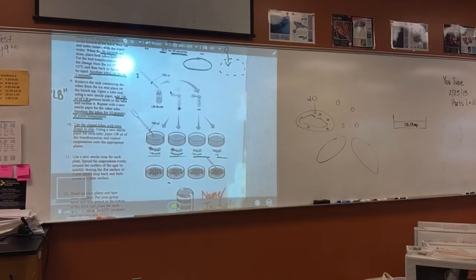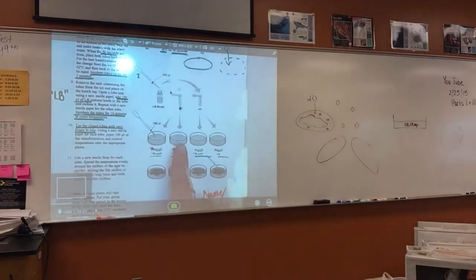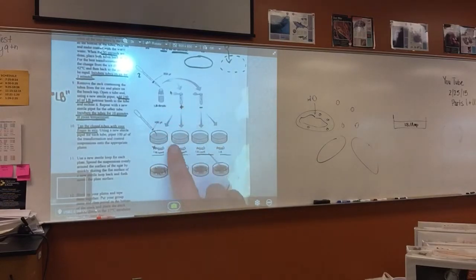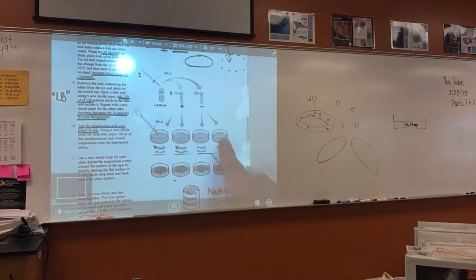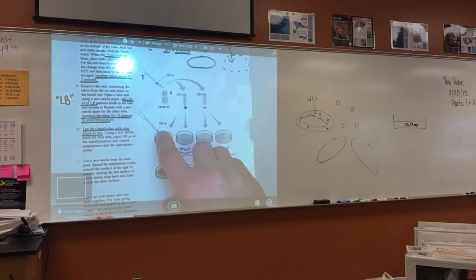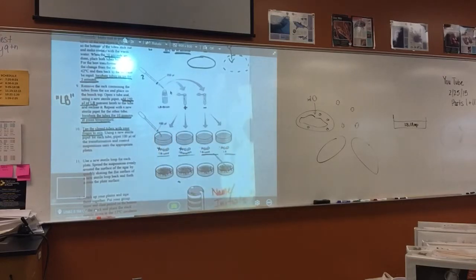When you're ready to plate it, you take your four plates. Tap the tube on your table to get all the liquid to the bottom, because when you flick it, it may splash a little bit along the side. And you're putting, as it says here, what bacteria on what plate. You're using 100 microliters, which is right below the first little indentation below that 250.